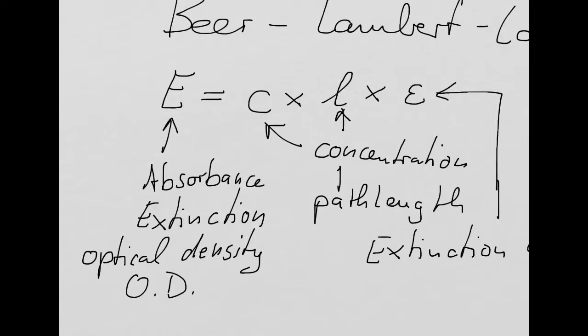And I say that because I don't know whether I should call it entertainment or shock and horror. Very often you give students a nice question. You say, a substance has an extinction coefficient at 420 nanometer of such and such, and the absorbance is 0.3.